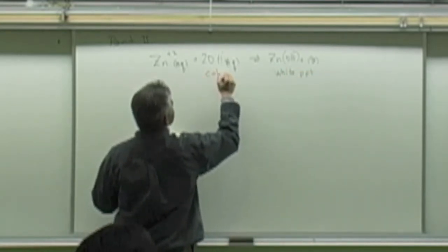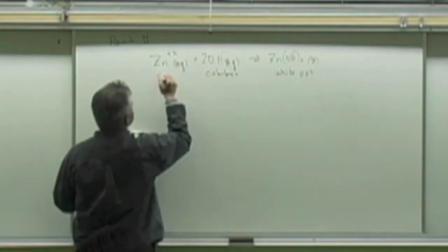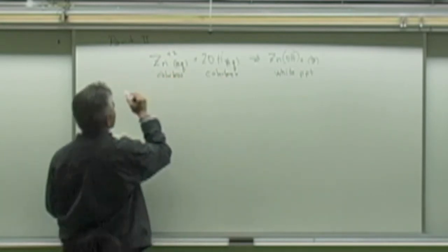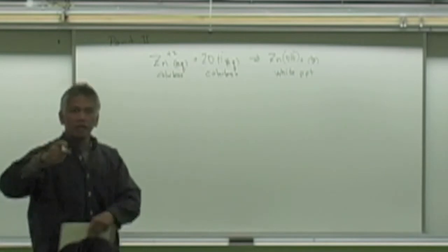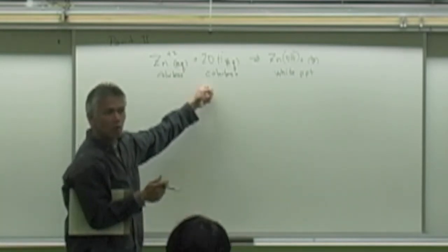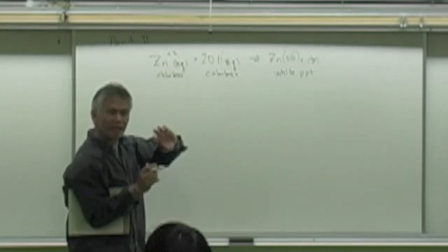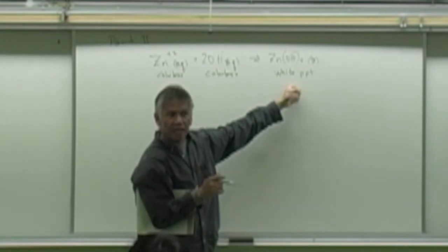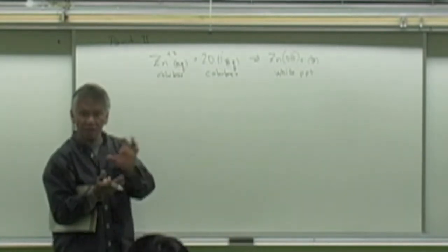These are colorless. So when you see a test tube that is colorless, it basically tells you it's predominantly these chemicals. When you see a test tube that has a white cloudy tinge to it, or even a white precipitate, you can essentially say it's dominated by these chemicals. These chemicals will all be in the mixture.